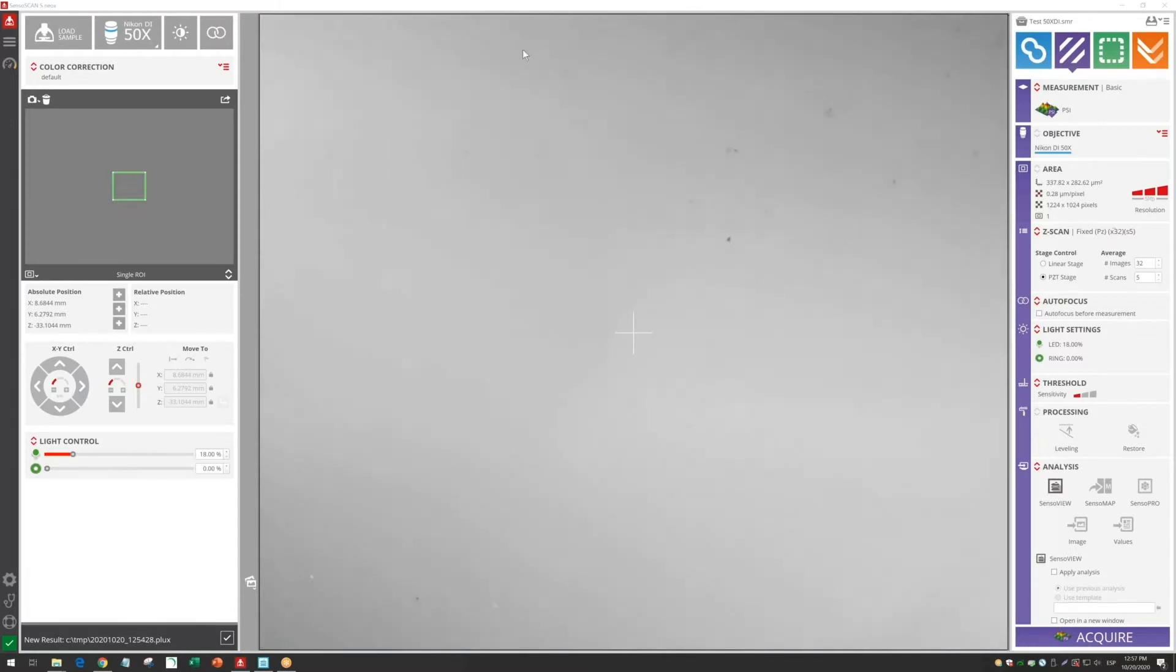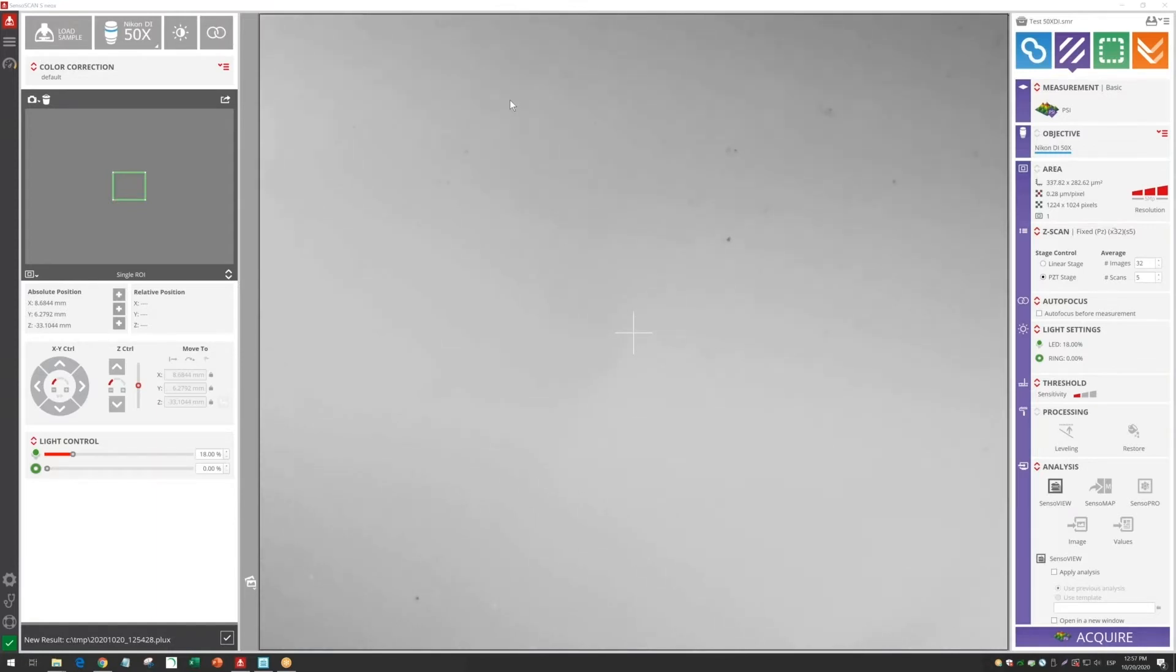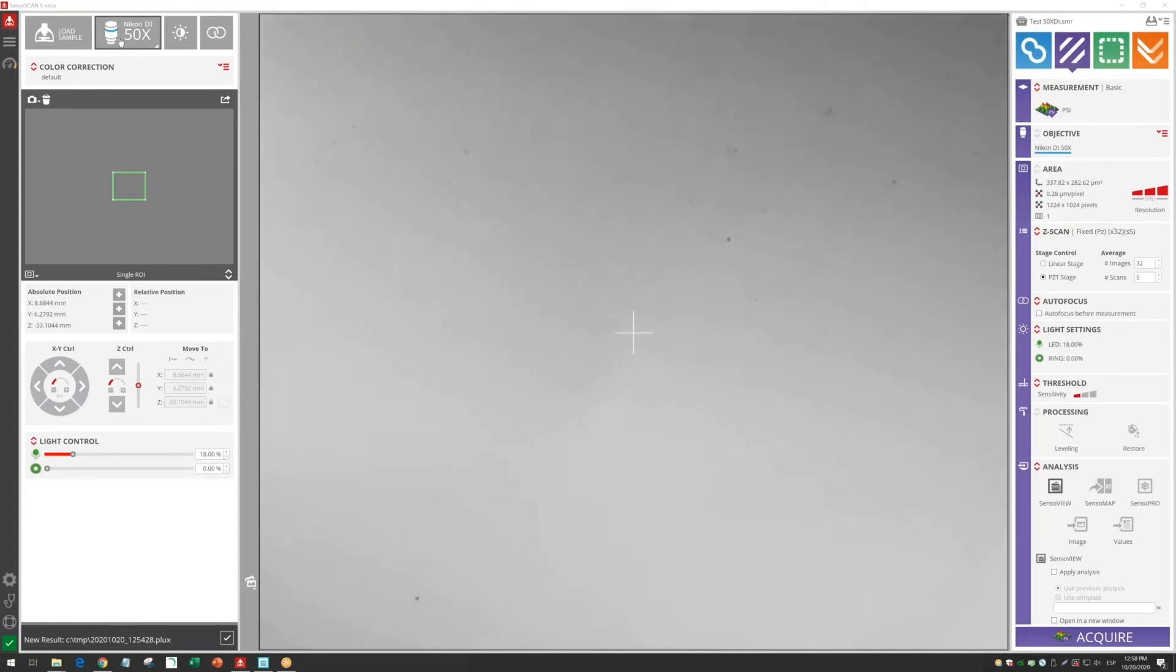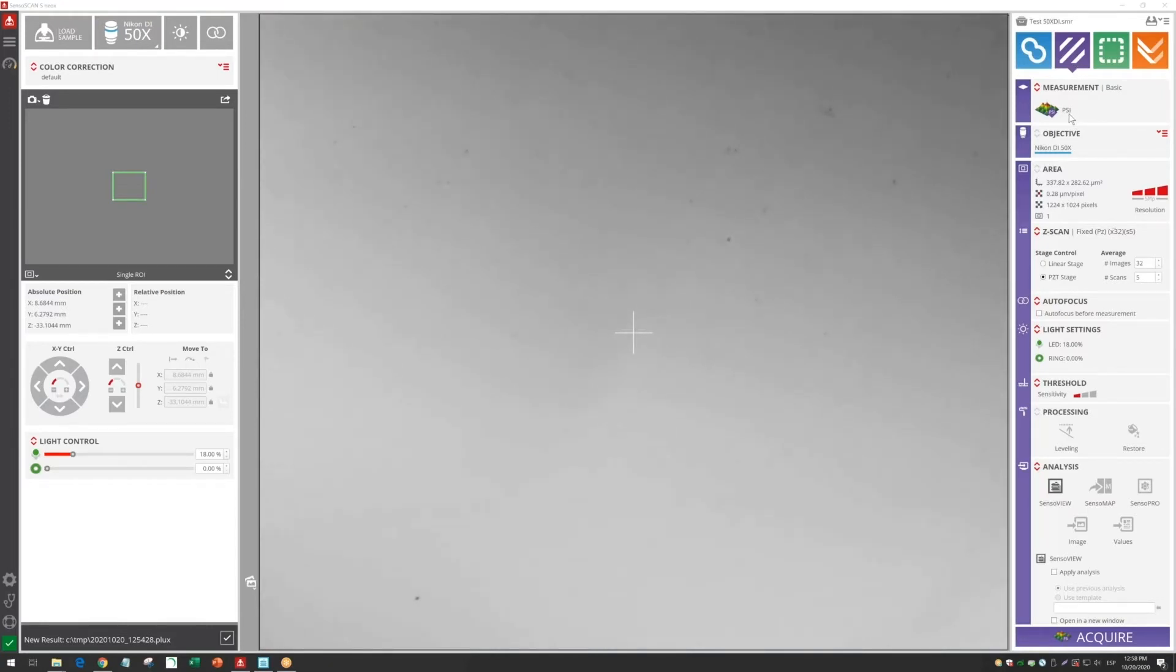For taking this measurement, where the roughness is probably below a sub-nanometer roughness value, I'm going to use an interferometry objective 50x lens, which is a very good compromise between vertical and lateral resolution, and I'm going to work with phase-shift interferometry. There's a NEOC system working with this technique. The system is offering a system noise of 0.01 nanometers.